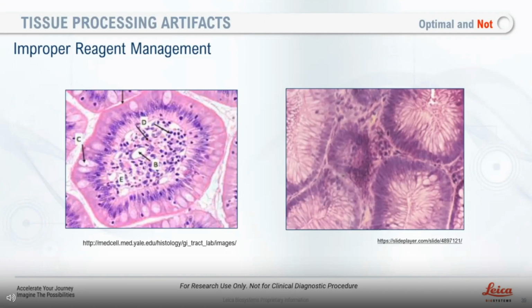How long must tissue remain in a fixative and still be good for processing? Good question. What I've seen in the laboratory, of course, is different in life science versus clinical. A lot of times in clinical we're required to hold it for a minimum amount of time, where I'm not sure in life science what the regulations are.